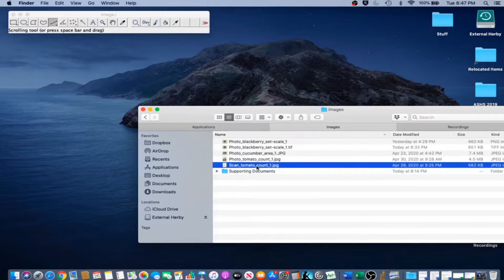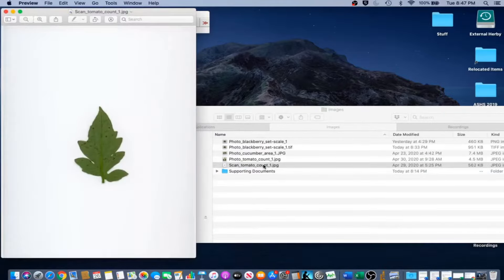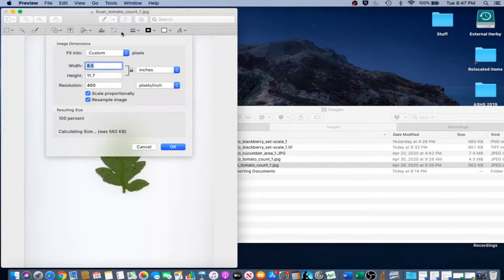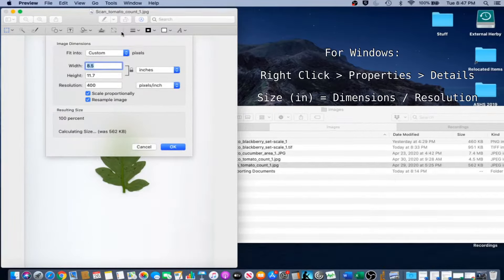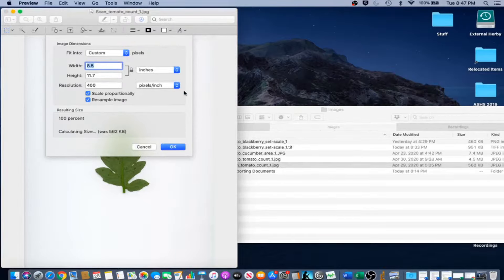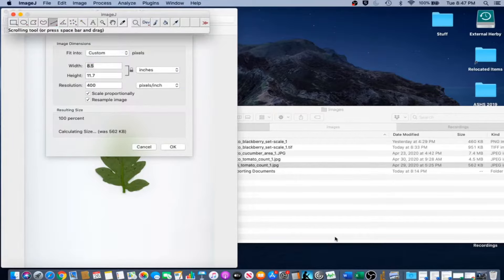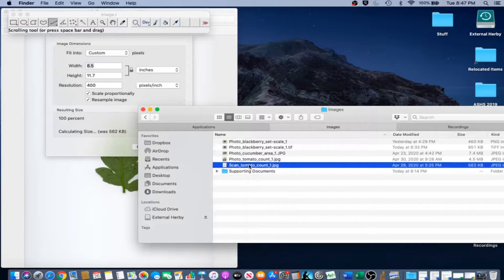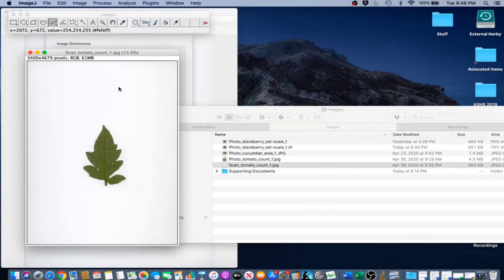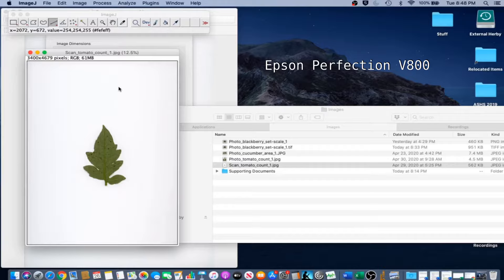The first step in scaling scanned images is to obtain the image pixel dimensions, resolution, and physical size. On a Mac, the image's physical size in inches, its DPI, and its pixel dimensions can be obtained by opening the image in Preview and going to Tools, Adjust Size. The second step is to import the image to ImageJ — we're just going to use the drag and drop technique. This is a scanned image of a tomato leaf from an Epson Perfection V800 flatbed scanner.